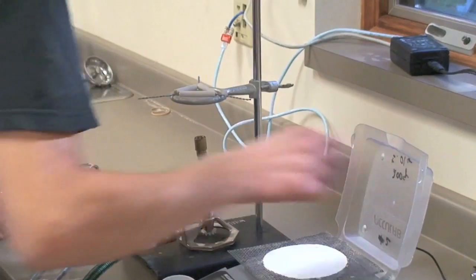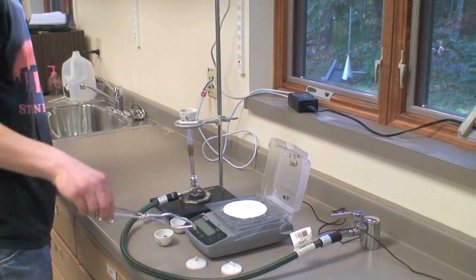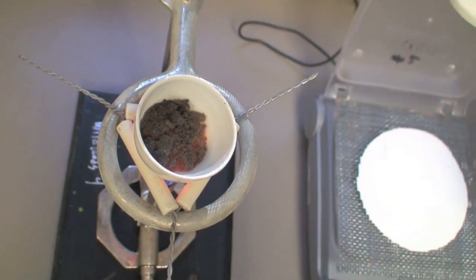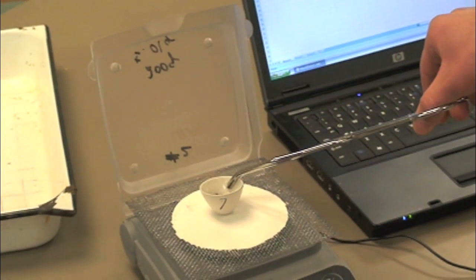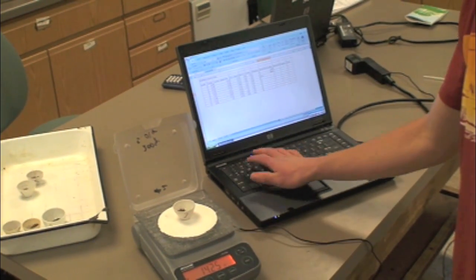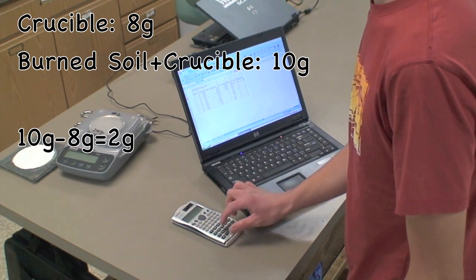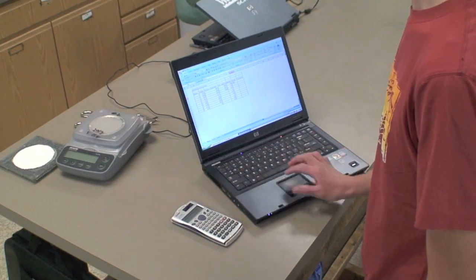If you don't have a muffle furnace, you can use a Bunsen burner. You will need to have a way to safely hold the crucibles above the Bunsen burner. Each crucible will need to be above the flame of the Bunsen burner for about a half hour. Weigh the crucibles again and put the weights into your data table, noting that the organic matter is no longer in the soil. Now subtract the weight of the crucible from the weight of the burned soil and crucible combined. This gives you the weight of the burned soil alone. Do this for each crucible containing soil and record these weights into your data table, noting that the soil has had the organic matter burned off.